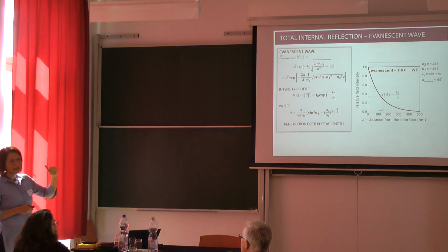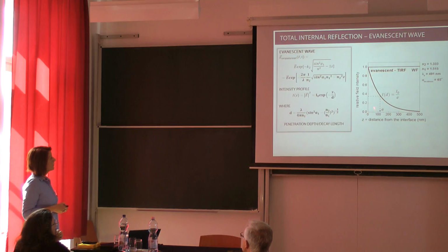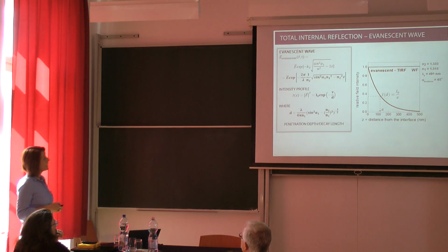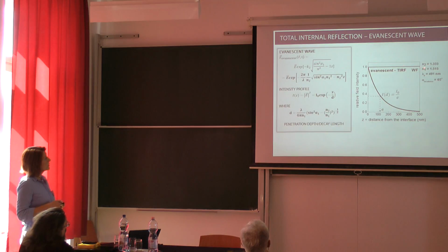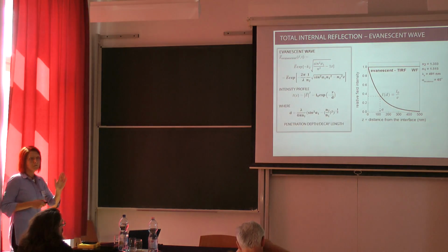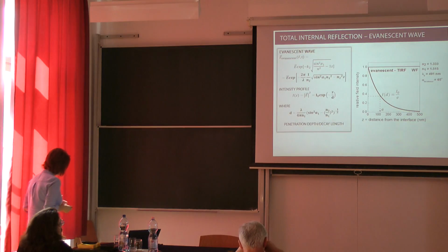So if you consider the evanescent excitation field, you can illuminate your fluorophores in the sample only within this narrow region that decays within a few hundreds of nanometers. If you compare with the wide field illumination that is schematically shown here, then with wide field fluorescence imaging you will illuminate all the layers through the whole thickness of the sample.